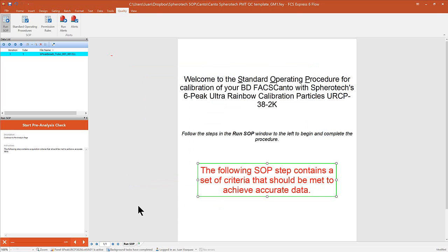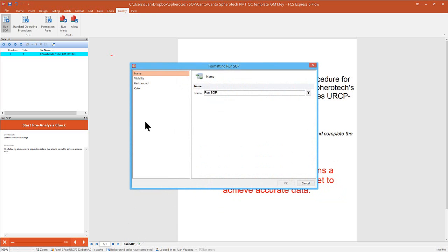Okay? And it's the same idea with pages. So we can hide pages as well, where again we can make it always visible, never visible, or we can customize that visibility based off of a particular condition or a sequence of conditions.